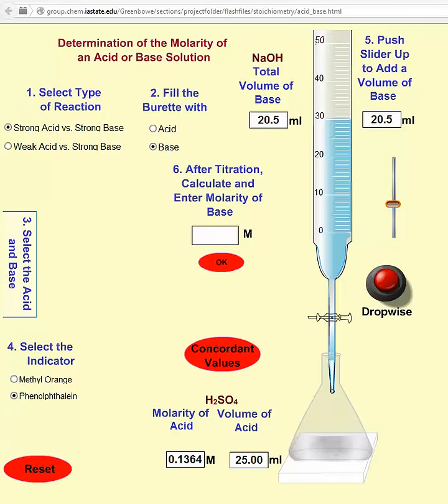I'm going to start adding a little bit less. I'm going to add approximately 5 cubic centimeters. Doesn't look as though anything is changing yet. Perhaps another 5 and release. Nothing's happening yet, so one at a time would be great. Approximately 1 cubic centimeter, watch over there, is being added at a time.